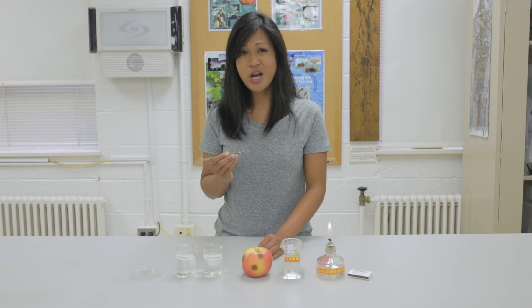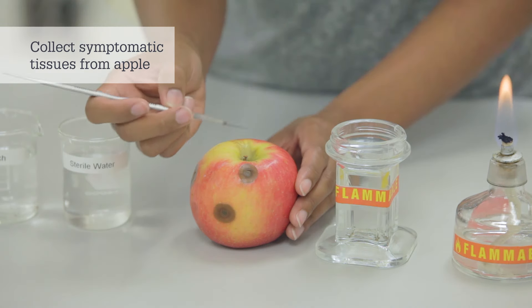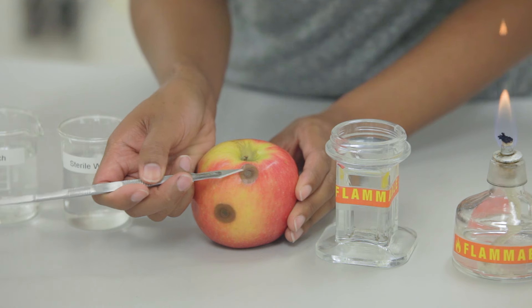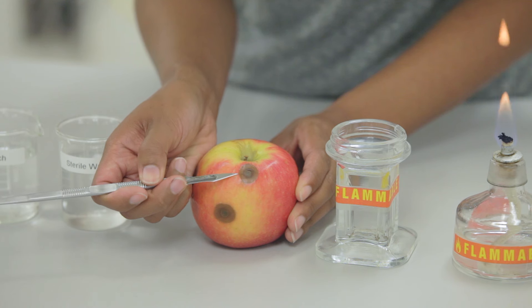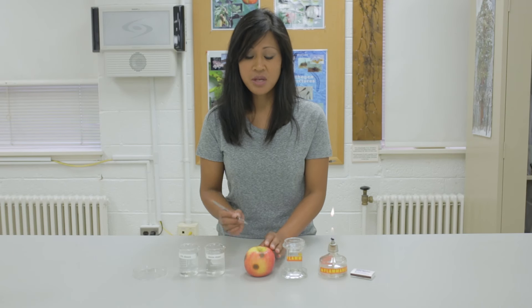Using the sterile scalpel, we're now ready to collect symptomatic tissue from the apple. Be sure to collect tissue from an area that contains both diseased and healthy tissue, as the pathogen is most active at this advancing edge of the lesion. Remove several small pieces from the edge of the lesion.